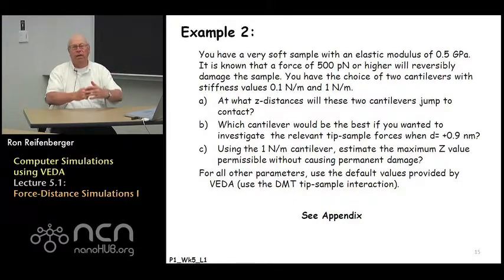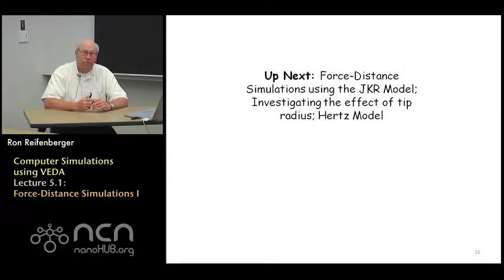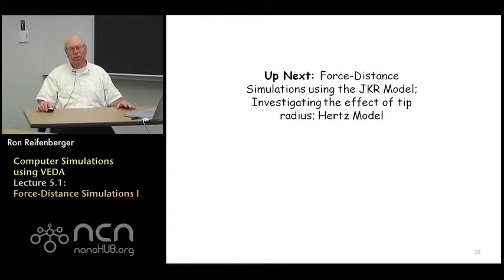Hopefully this gives you a broad enough overview that you can actually go into VEDA and start to simulate curves that are of interest to you and your research topic. So up next, we're going to do a little bit more force versus distance simulations. We're going to talk a little bit about the JKR model, and we're going to investigate the radius of the tip explicitly, and we'll also have an example on capillary forces involving the Hertz model. So come on back to second lecture of week 5, and we'll discuss some of these simulations in more detail.